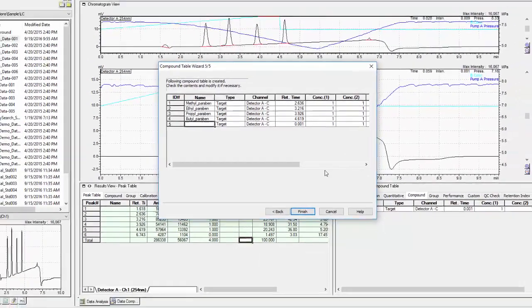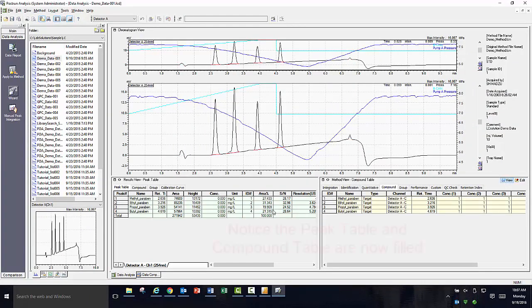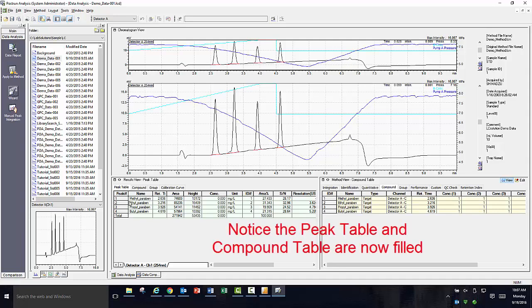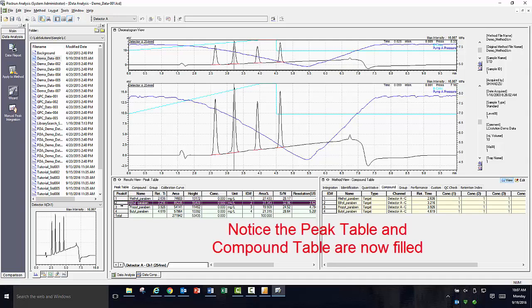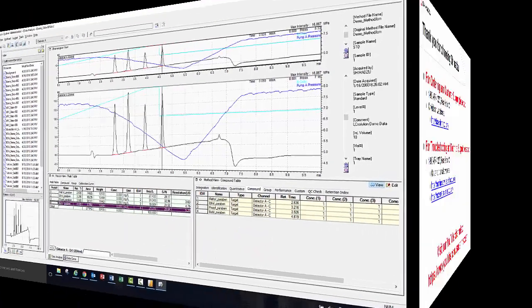When you finally click finish, the changes you made will be applied to your data file and should be reflected in both your peak table and your compound table. Notice how the peak table is now reflecting each of my peaks of interest and identifies them in the chromatogram when I click on them individually in the row.